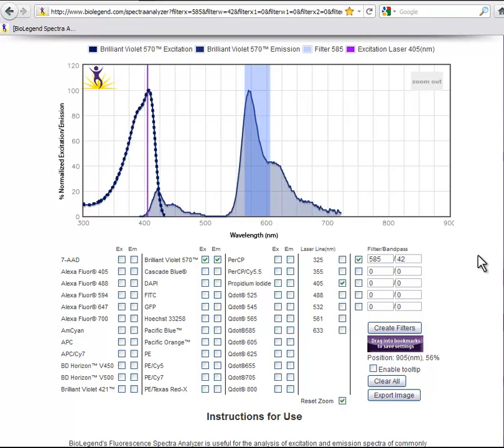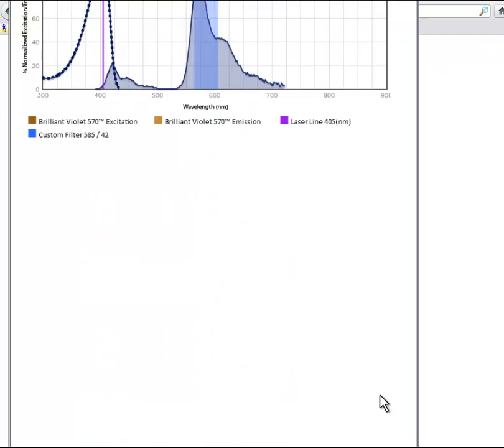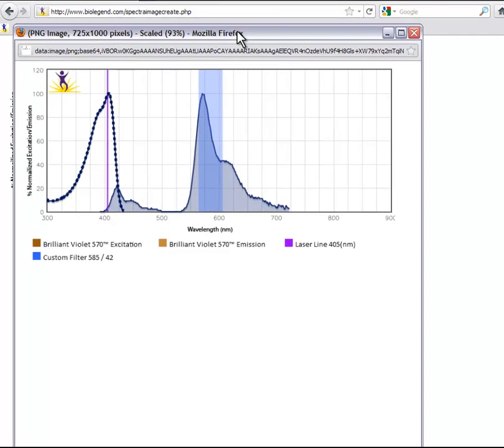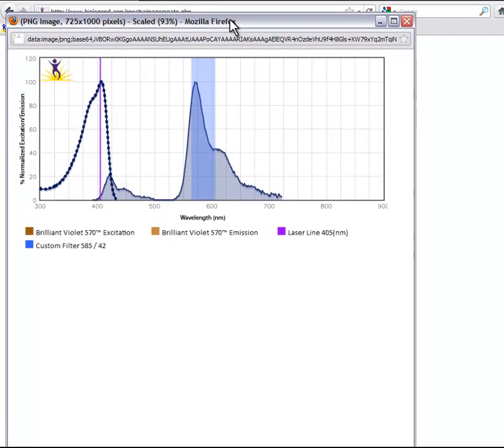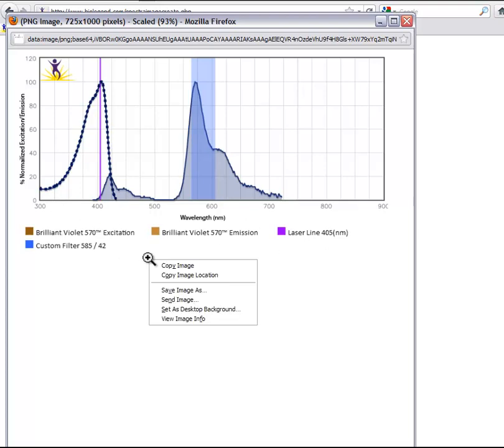You can export and save images of the graphs that you have displayed. Simply click the Export Image button. This brings up a new window with your image and a legend of your chosen settings. From here, right-click and save.